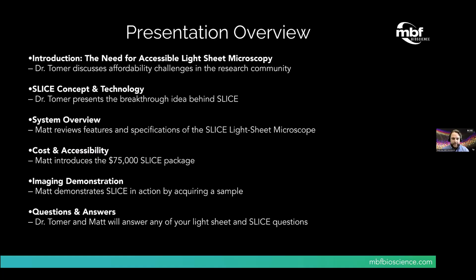Then we'll walk through a demonstration of how to set up a tissue imaging session using the SLICE and showcase a final image, giving you a glimpse of the results you could be achieving in your own lab. Finally, Dr. Tomer and I will be available for a Q&A session at the end of this presentation. I'd like to now turn it over to Dr. Tomer to begin his portion of the presentation.